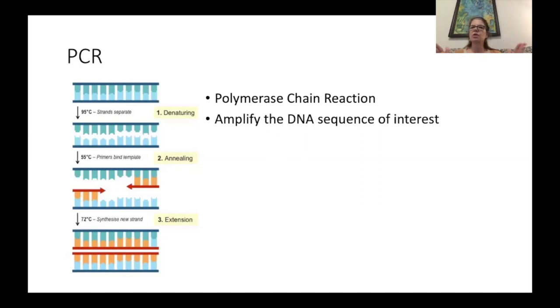But within the middle of that amplified region, there are regions of sequence divergence. And it is in sequencing those regions that you're able to determine what's unique about the sequence that allows you to determine that it belongs to a particular microorganism, either at the genus or the genus species level. Another reason why we use the 16S ribosomal RNA gene is that it's present in multiple copy number in the genome of the bacteria.